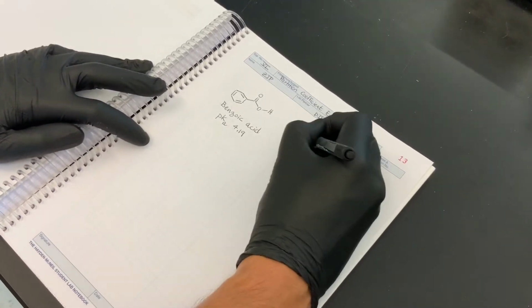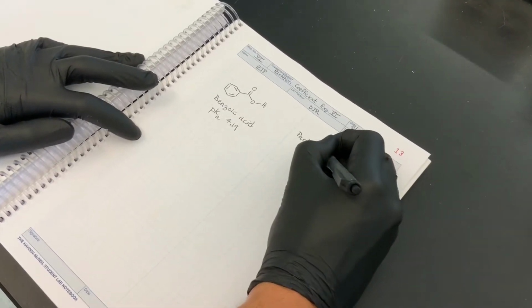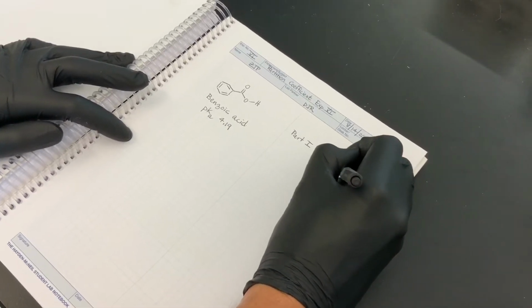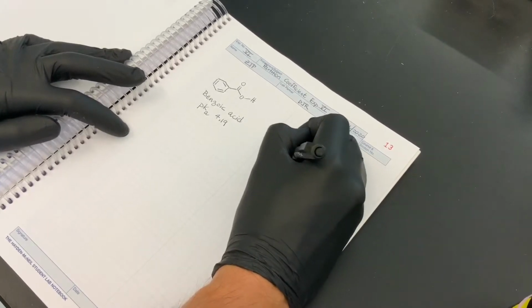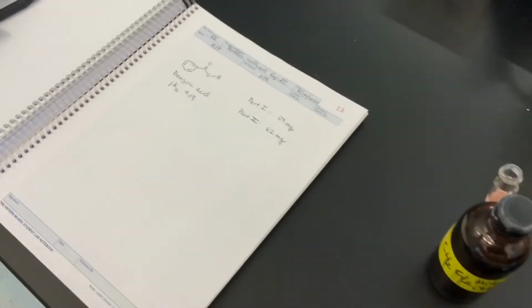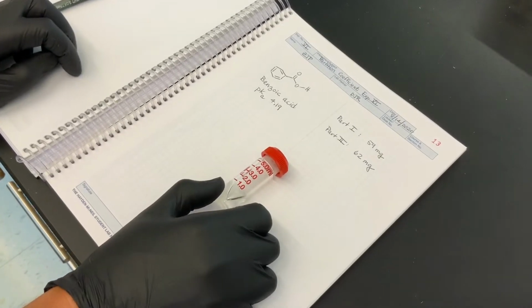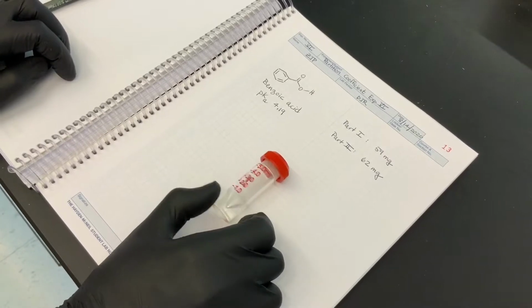And so for part 1, at the balance, we had measured out, or we are going to start with 59 milligrams. And for part 2, we are going to start with 62 milligrams. So now we're going to transfer this to a 5 milliliter reaction vial. So we used this in experiment 4 for fractional distillation.